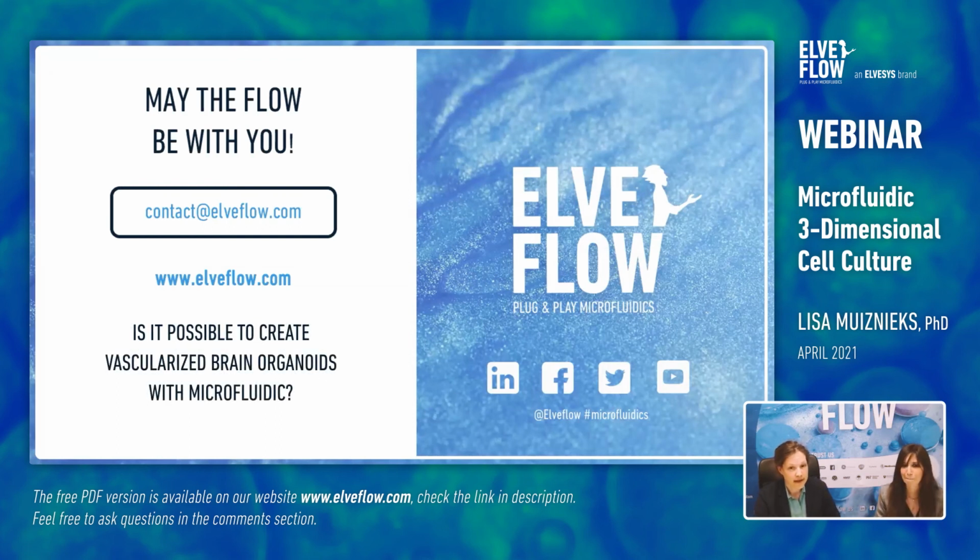So I think organoids are quite specific. I think the idea is, yes, if you have the cells, you can try. It would obviously require some optimization and whatnot. But if you have the cell type that you wish to form into an organoid, it will be possible using microfluidics.